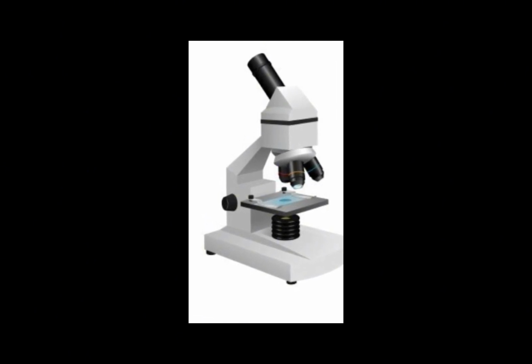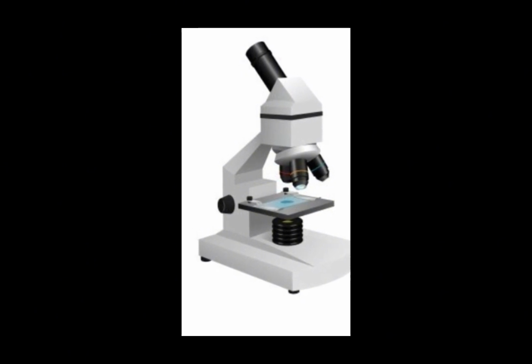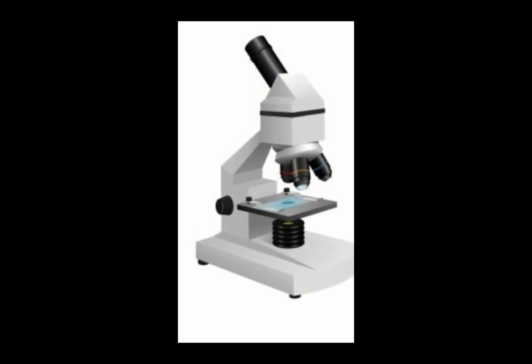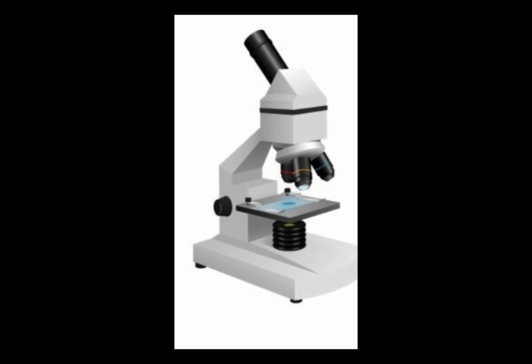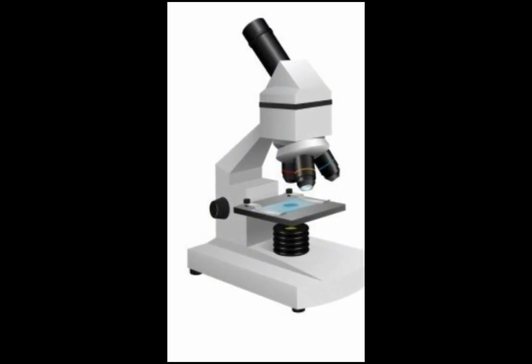Students can make another slide with methylene blue and without adding any stain to see the difference between stained and non-stained cells. So this is what we are going to observe.